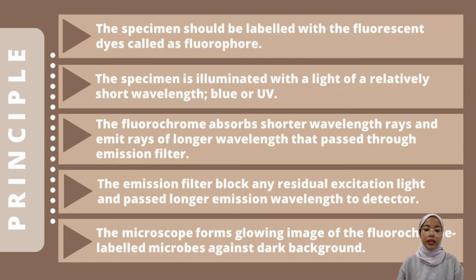Fluorescence microscopy enables highly specific labeling of target proteins but possesses too low resolution to reveal details of most virus-associated structures. In order to improve this method, super resolution fluorescence microscopy, which is the SRFM, can be used to further discover the interaction between the host and the SARS-CoV-2.